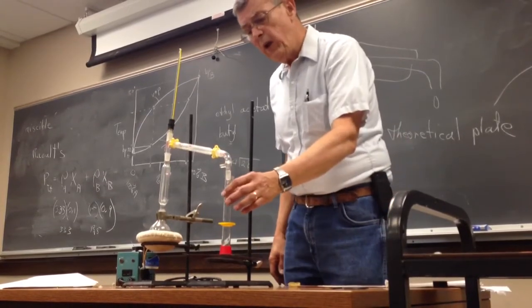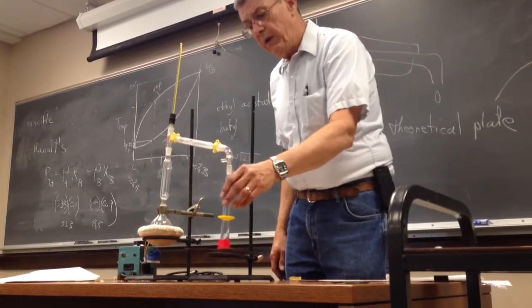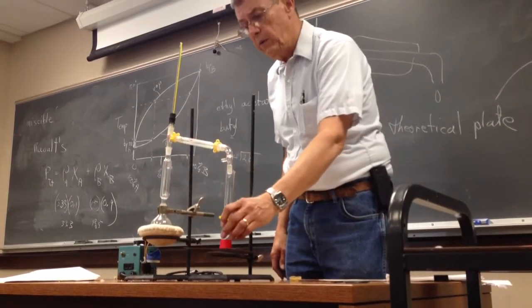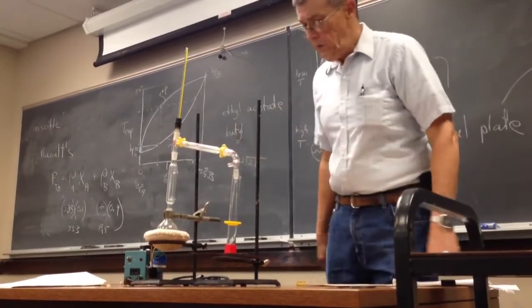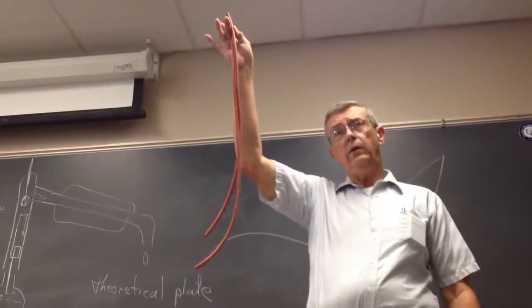Now I've got it just up a little bit. I can get it off of there real easily. But if I inadvertently bump that a little bit, it's not going to go anyplace. So that's a nice way to set that up. This is going to be a condenser, so I need water in there. Condenser tubing, that's this size tubing.